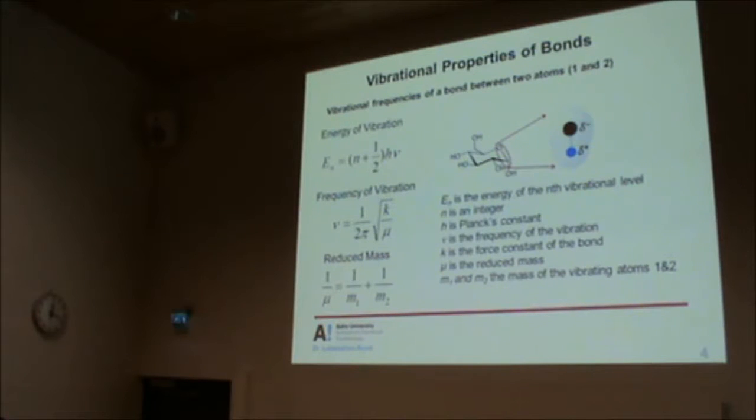The way we see atoms in a bond is two masses connected to each other by a spring. So this is equivalent to a spring constant in the classical picture of two spheres bonded together by a spring which is vibrating. So frequency is directly related to the force constant, and it is inversely related to the reduced mass. If the atoms are heavier, they're going to vibrate at much lower frequencies. That is what this means.